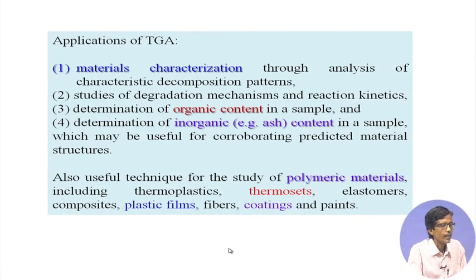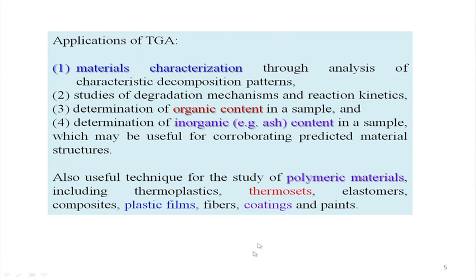So, altogether we see that a huge number of applications we can have with this TGA. The first application that will come to our mind is the materials characterization. So far we are talking about the corresponding materials. So, any material including your organic sample or organic molecule, inorganic salts, we can characterize very nicely for its thermal stability also.